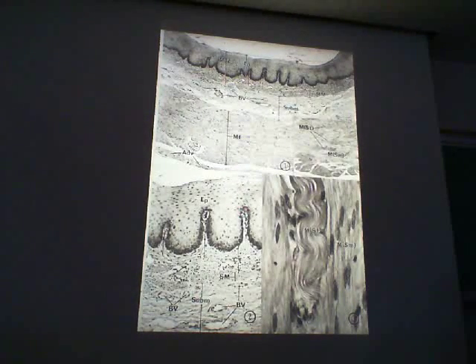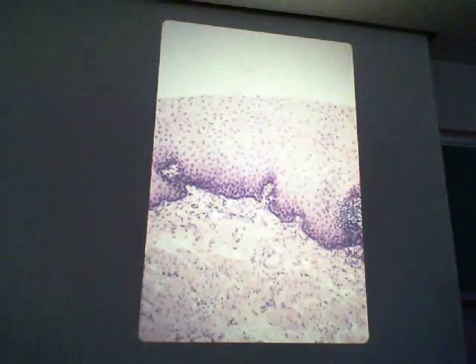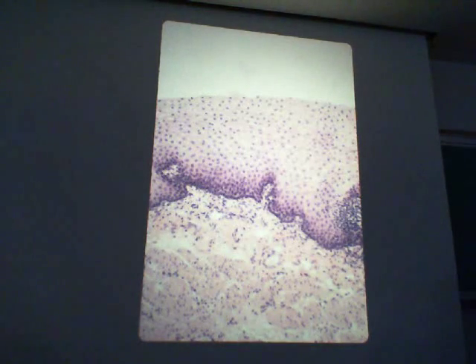And what is this tissue right here? Okay, well that's one you can look up tonight. What is this tissue?